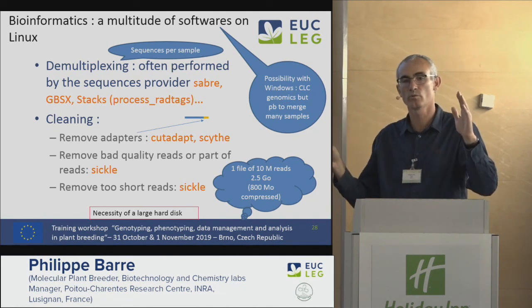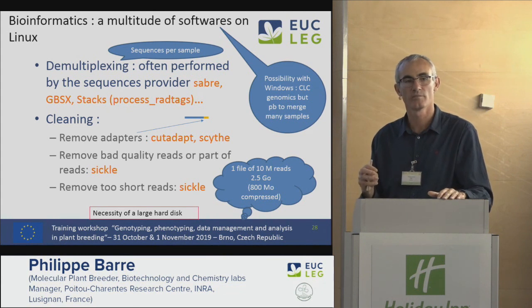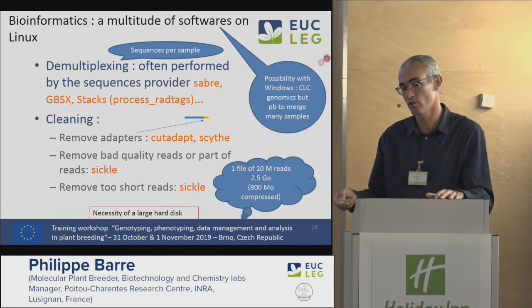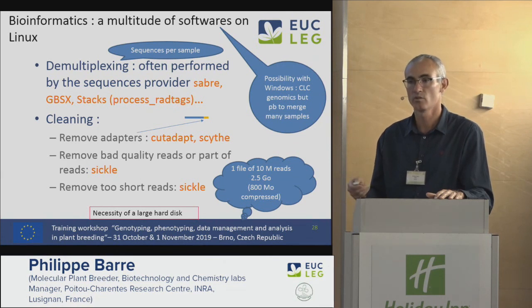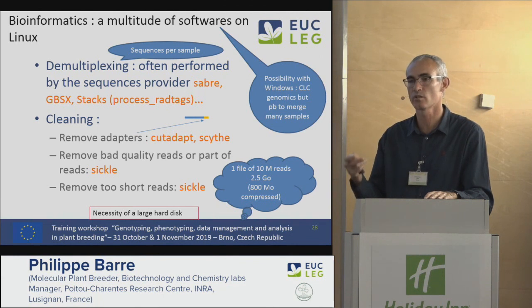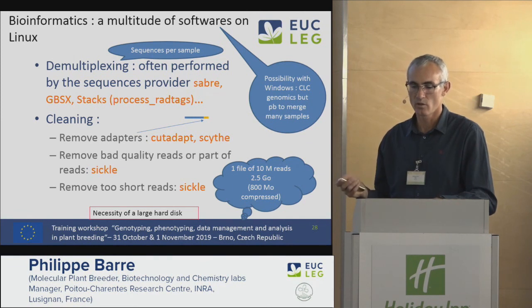It's not possible to have the GVCF. So that was, for me, a major limitation, but you can use it for a different study, and it's very convenient because you see your sequences. It could have a limitation when you have a lot of samples to deal with.